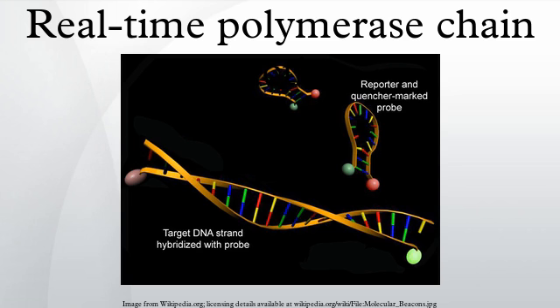Detection of genetically modified organisms. Qpcr using reverse transcription can be used to detect GMOs given its sensitivity and dynamic range in detecting DNA. Alternatives such as DNA or protein analysis are usually less sensitive. Specific primers are used that amplify not the transgene but the promoter, terminator or even intermediate sequences used during the process of engineering the vector.